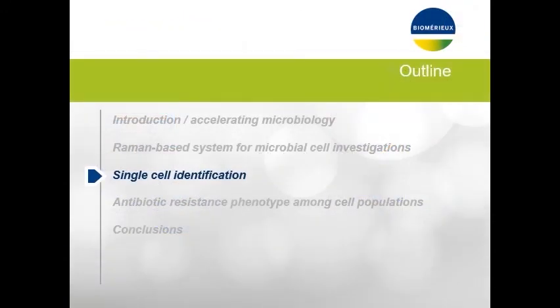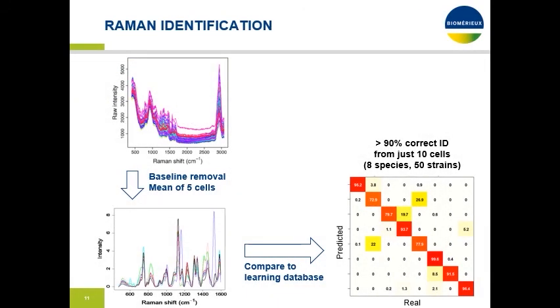So the result that we obtain using that, we'll find this kind of thing classically also in the literature. What I would like to emphasize is that starting from the raw spectra, you have to develop a very refined data processing tool in order to remove this baseline. For those who are familiar with this kind of spectra of microbiological matter, this is a CH peak, a region where you find the most part of the information about the organic composition of cells.